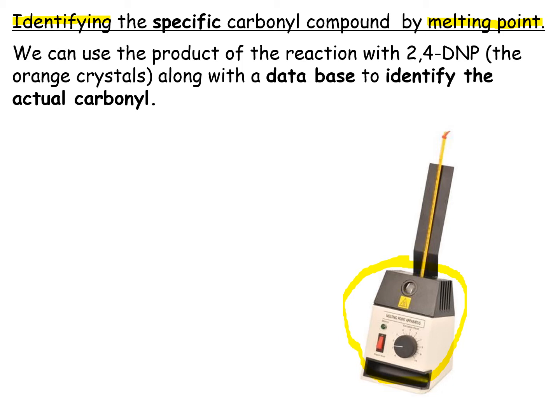So you've got your controls here where you can heat it up, and into that heater block you would put your sample, and it will be the solid that you're going to melt. So here for us it's going to be orange crystals, and we put that in. We only need a tiny amount. We put it into a little capillary tube, so that's like a super tiny test tube, if you will, and that sits in the heater along with the thermometer.